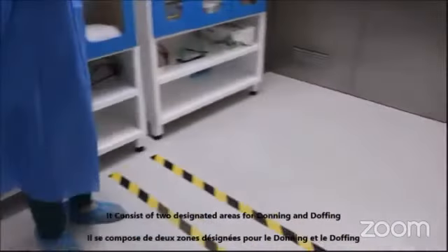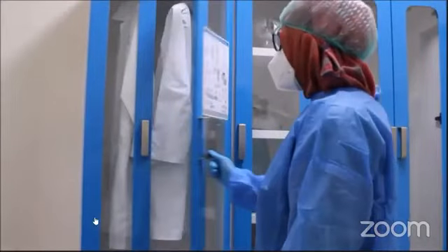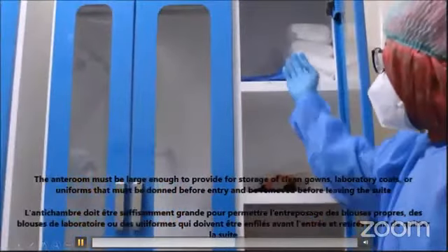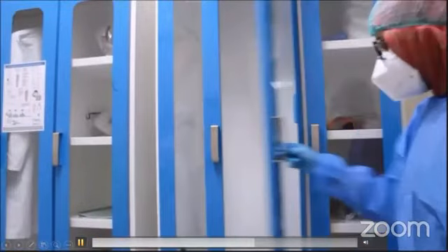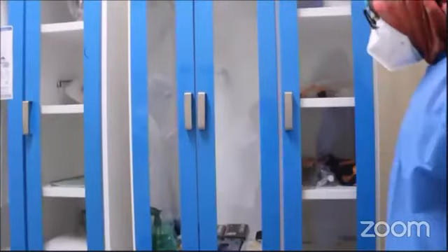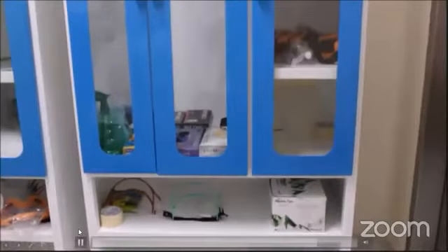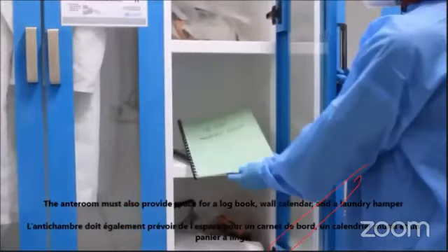It consists of 2 designated areas separate for donning and doffing. The anteroom must be large enough to provide storage of clean gowns, lab coats, or uniform that must be donned before entry and removed before leaving the room. The anteroom must provide the space for the log book.